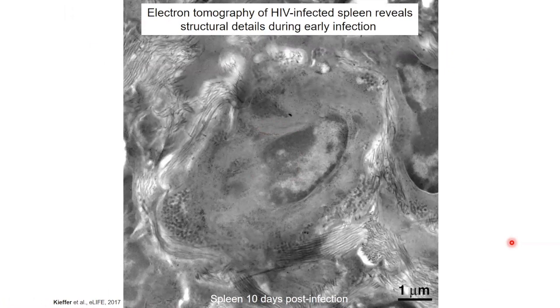What we can see here is, this is really cool. As we look at the movie, if it plays, it was having a little bit of trouble earlier, we can see collagen. This cell is completely surrounded by collagen, all around here. And then we have all these spots that look kind of interesting and different. What we can do is conduct tomography and start to look at this in greater detail.